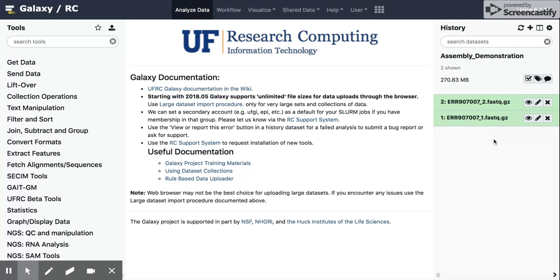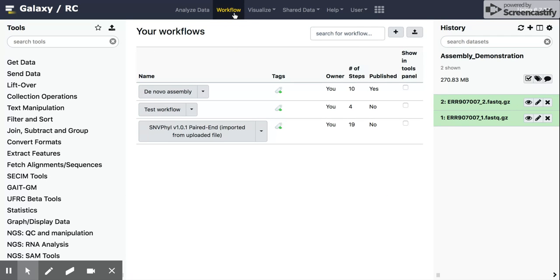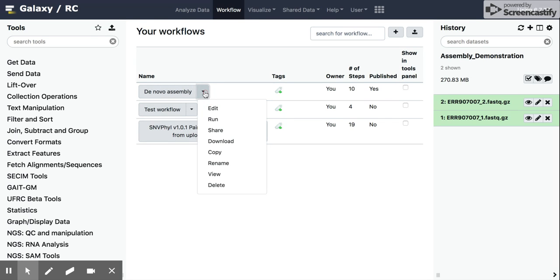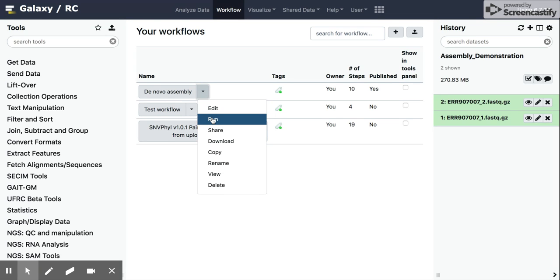Now what we're going to do is under Workflow, I'm going to click on this. And you see we're still in our history over here to the right. I'm going to click the de novo assembly, which we went through in the previous video. Click the drop down, and I'm going to hit the run button.